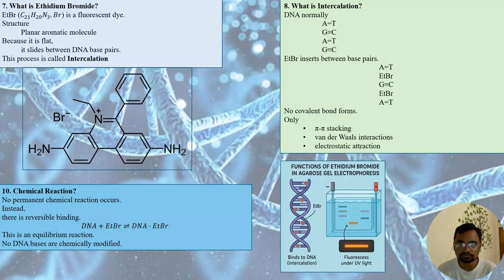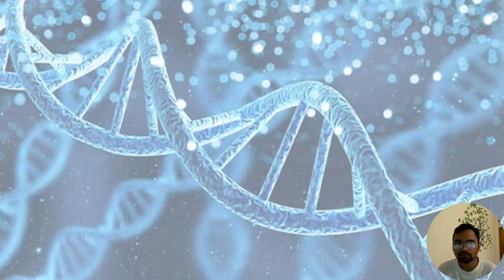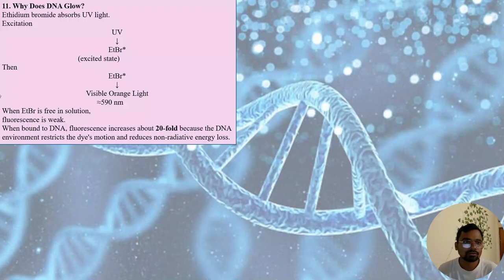Under UV light it gives fluorescence, and we take the image and get the band.